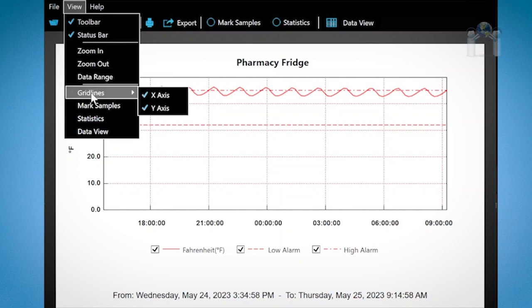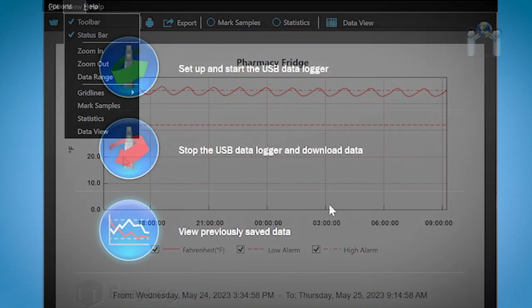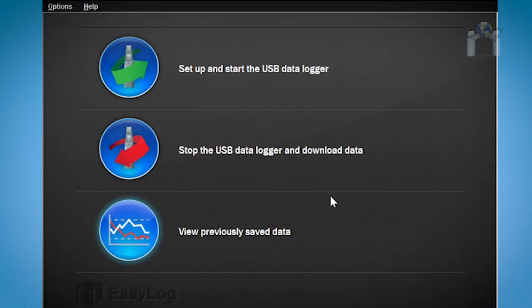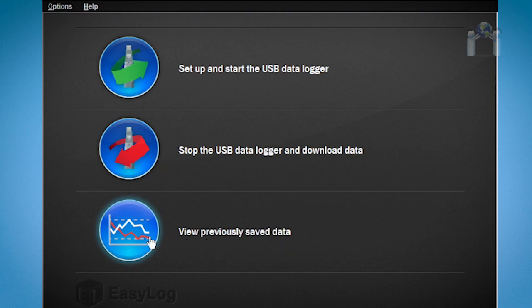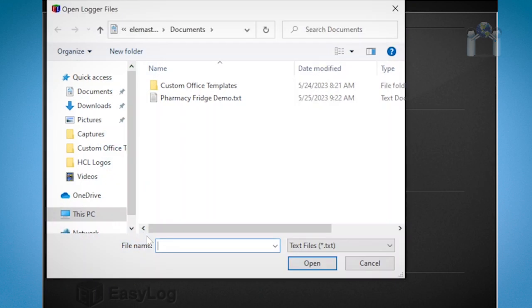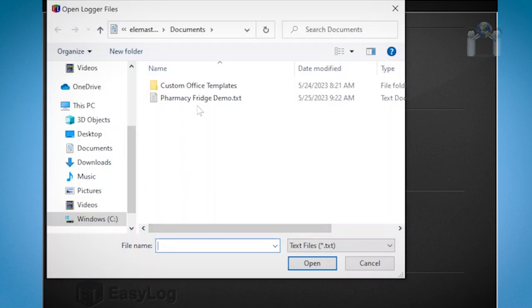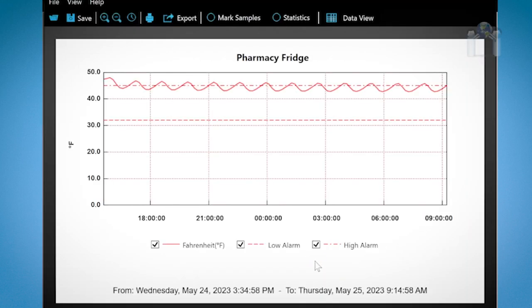You can review downloaded data anytime you wish by clicking on view previously saved data from the main menu. After you click on the button simply browse to where you saved your data and select the file you wish to view.